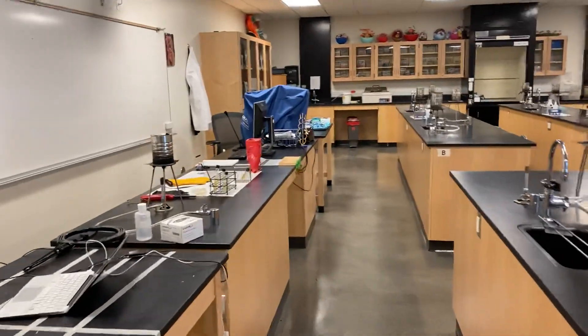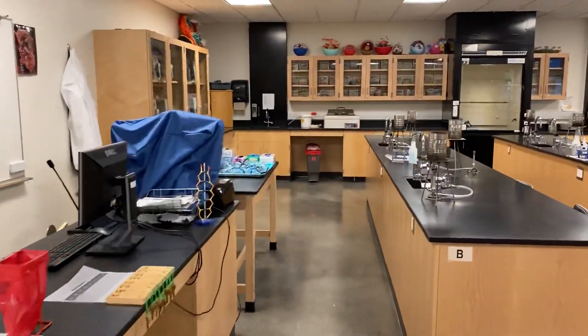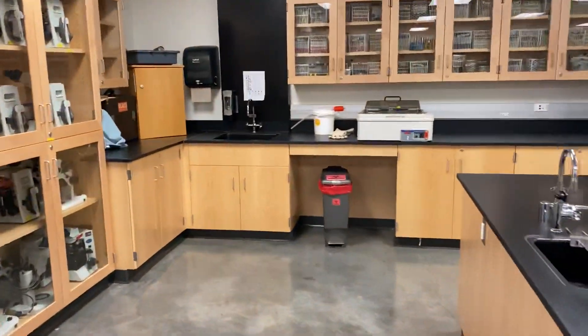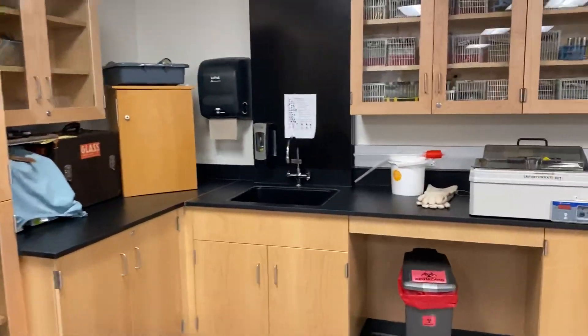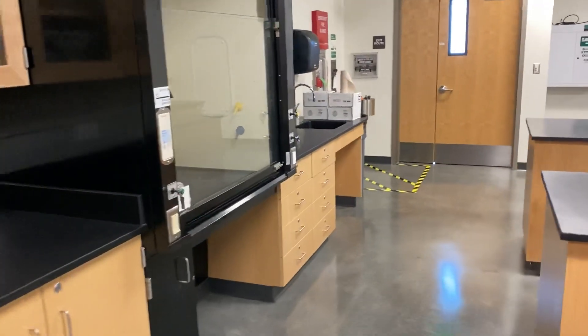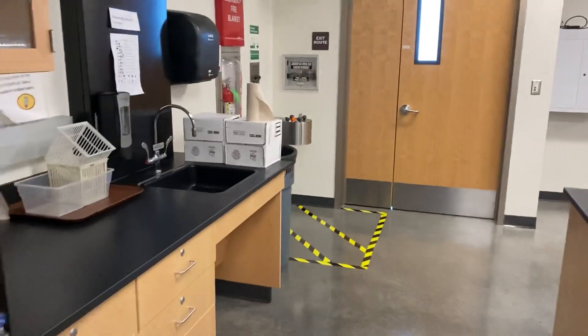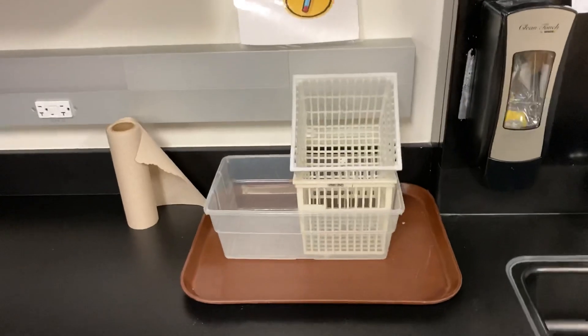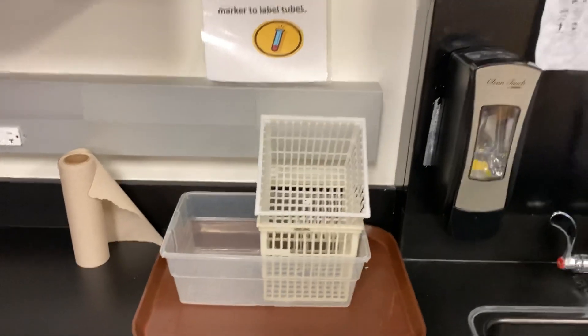Front of the room, obviously. Most of the time, a lot of the material you'll have to access will be back here. We'll have things like cans, water baths, and especially our sinks, where you'll be washing materials, disposing them, or letting them rinse out and dry.